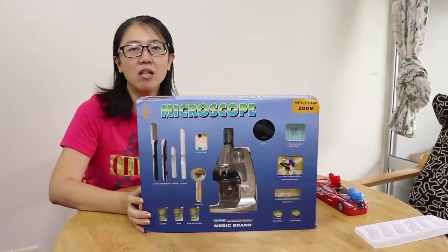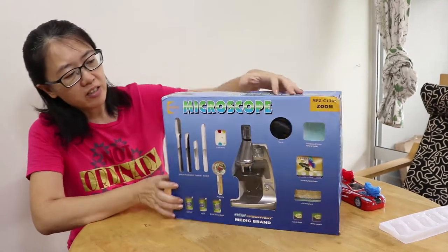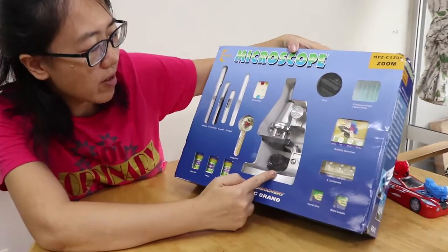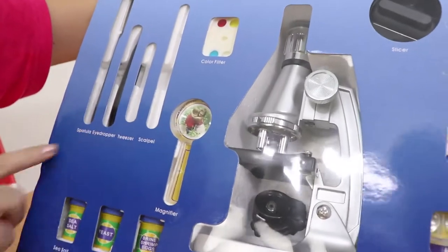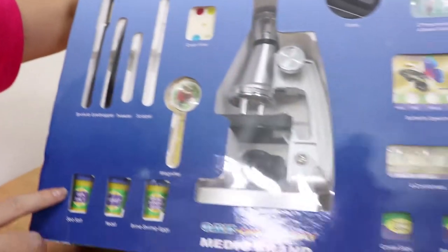Let's unbox this microscope. Let's take a look around. What can we see here? Of course we have the main item — the microscope. And then there's what I think is a magnifying glass, and these are some samples to check under the microscope.